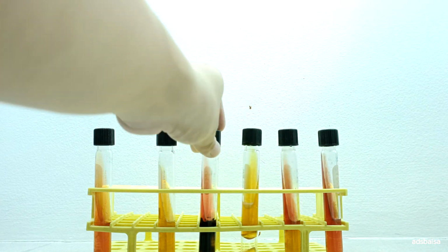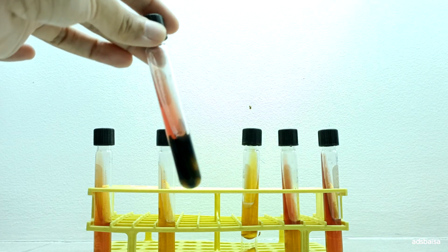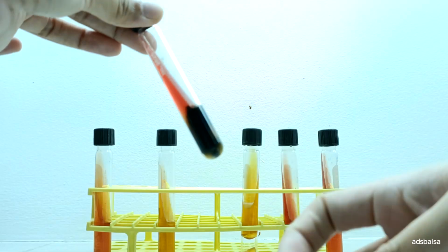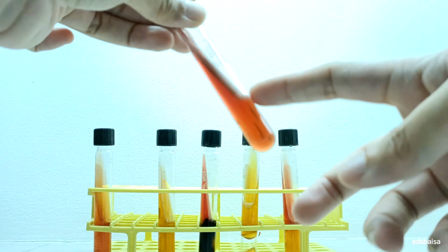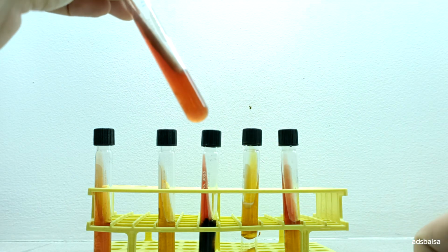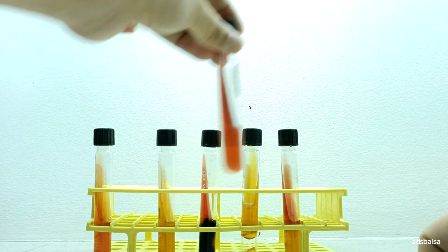We also have the hydrogen sulfide gas formation, which is seen by the blackening of the agar. A red slant and butt indicates that none of these sugars were fermented, and neither gas nor hydrogen sulfide were produced.